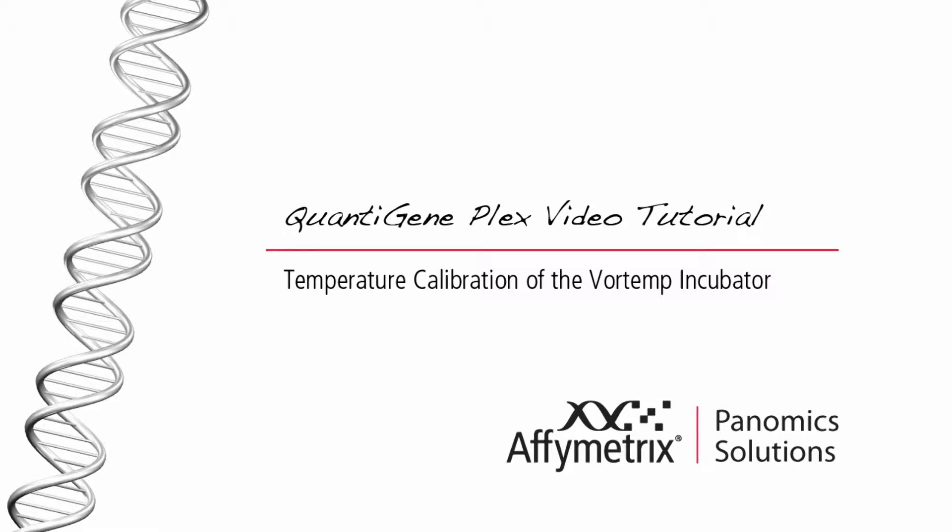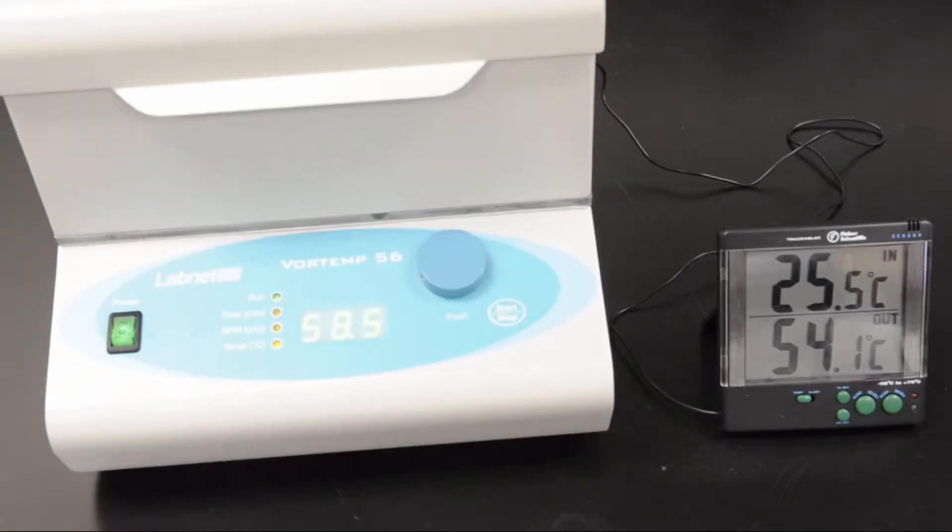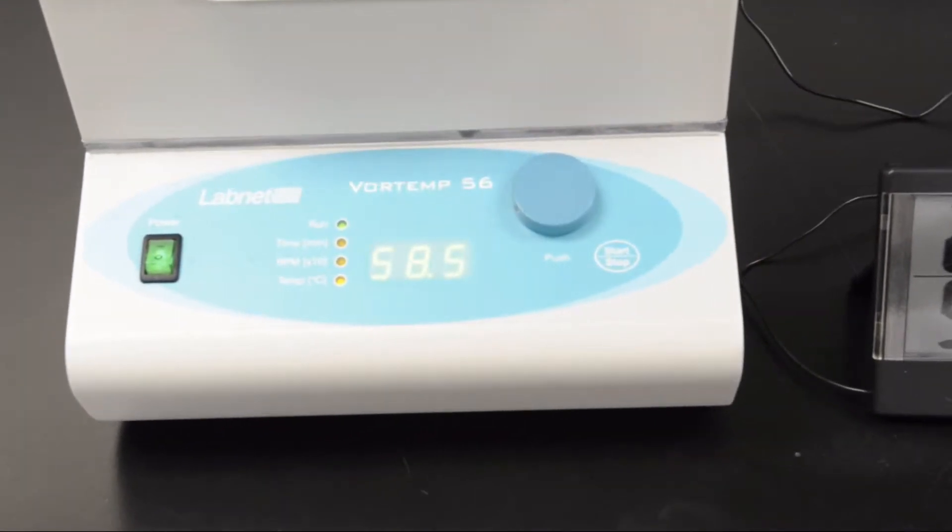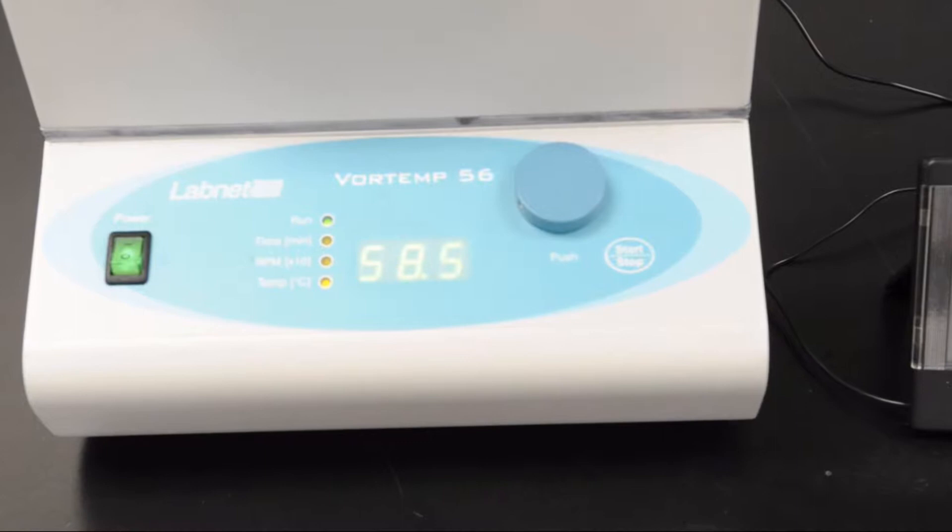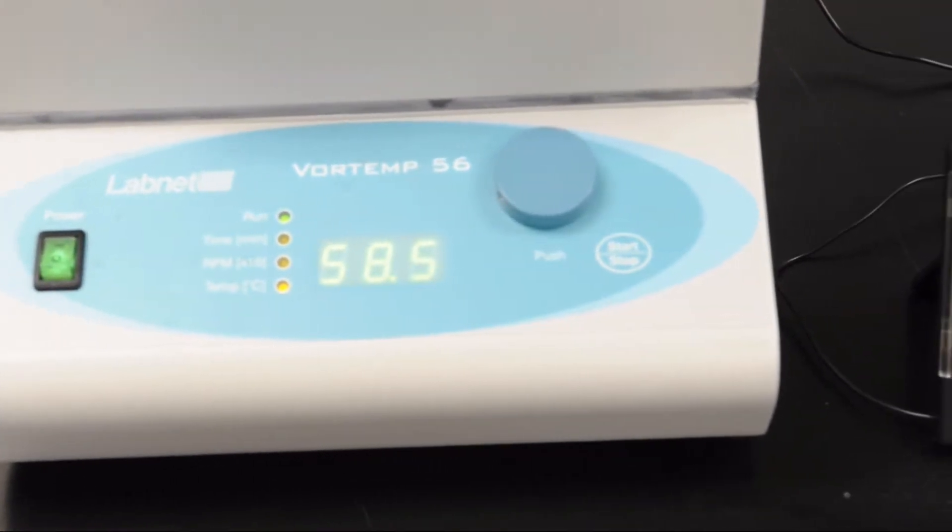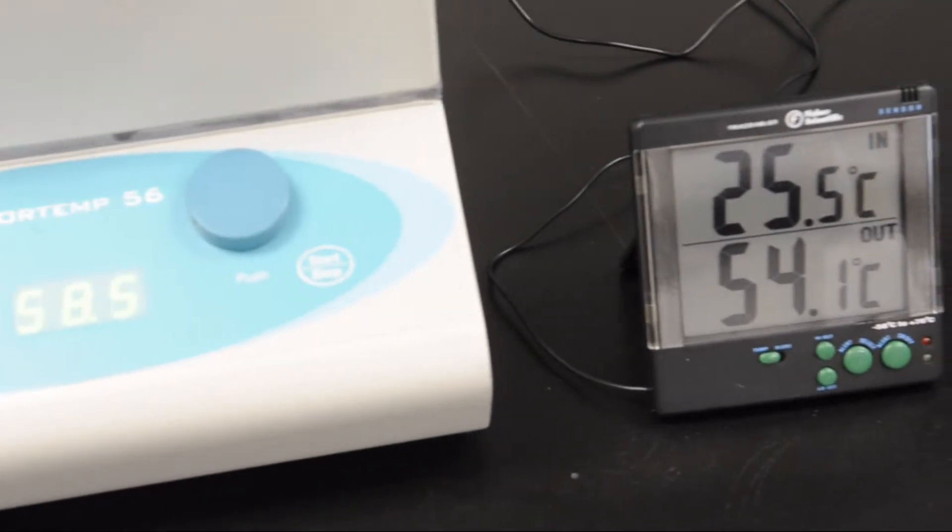This QuantaGene training tutorial provides instructions for calibrating the temperature of a Vortemp shaking incubator. This procedure is critical to the QuantaGene Plex assay because the assay is based on nucleic acid hybridization, and incorrect temperature settings can cause high background, loss of signal, or poor CVs.